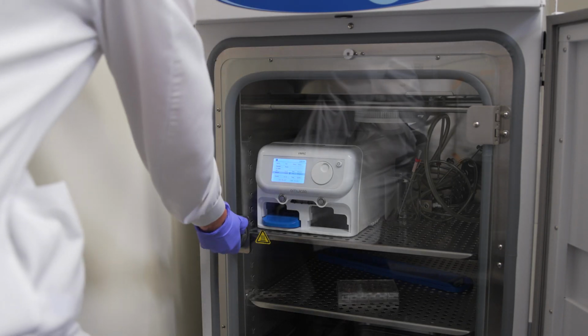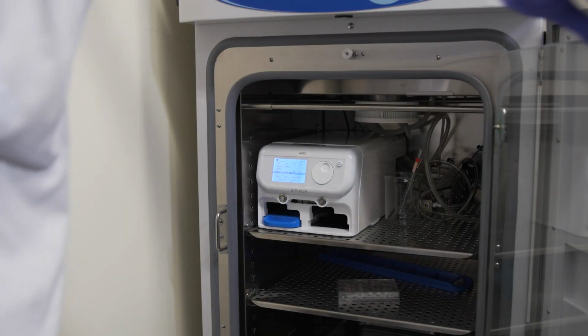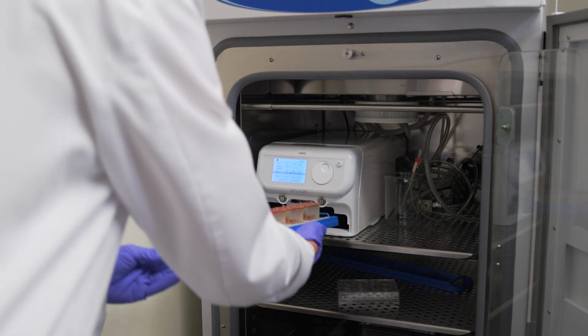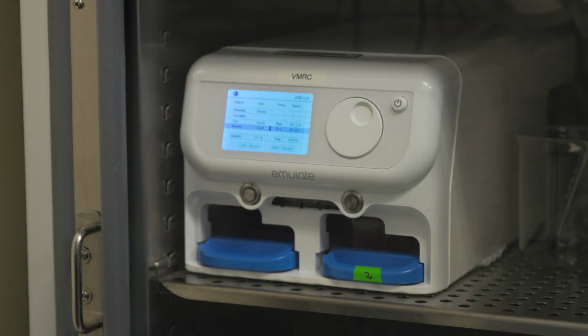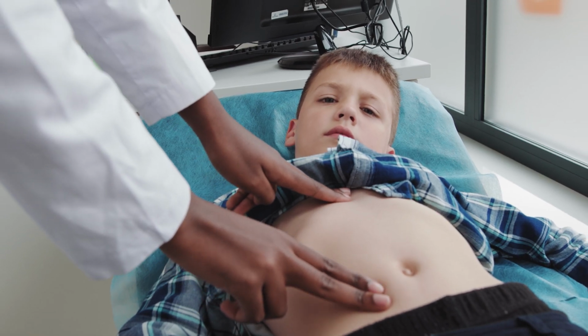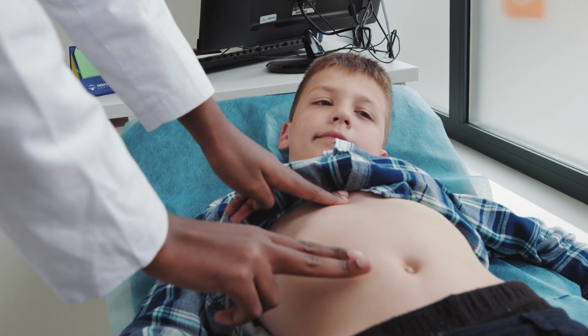We found that the mucus layer can undergo a broad dynamic change, such as height doubling, without changing the internal structure. And so we then used this colon chip with the mucus layer to study the response to this inflammatory stimulus. And we found that the inflammatory stimulus leads to swelling of the existing mucus layer and not new mucus production. That was something that was not previously known. And so the colon chip now offers a preclinical tool that we can use to study intestinal mucus physiology, and it also brings us one step closer to modeling and understanding inflammatory bowel diseases.